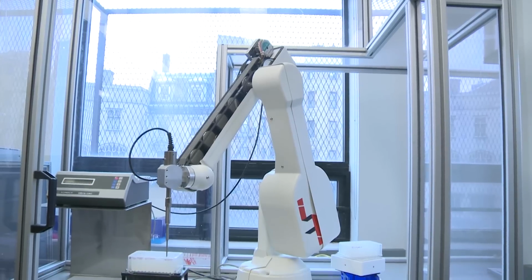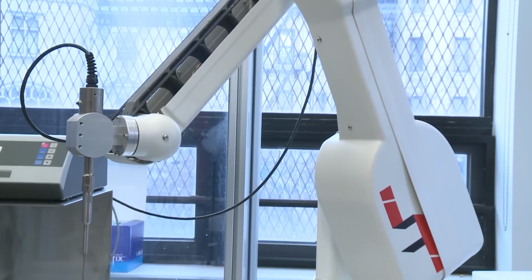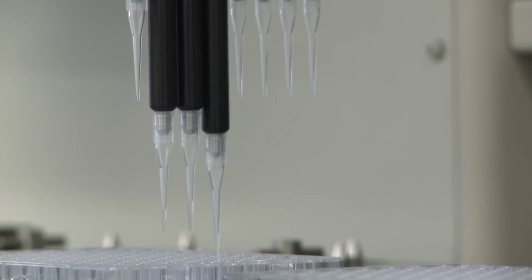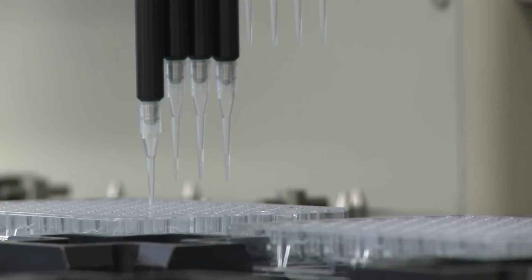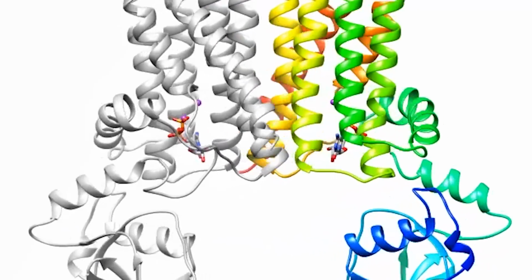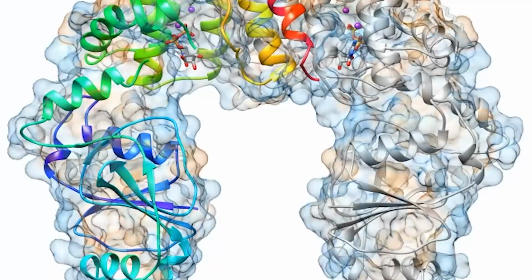The heart of our protein production facility lies in robotic devices that we have developed to be able to clone and express proteins in a high-throughput manner, many things simultaneously. These capabilities are being used to investigate in an efficient manner many kinds of proteins, but in particular by the New York Consortium on Membrane Protein Structure, NYCOMPS, we are investigating membrane proteins, and that's to the benefit of many of our investigators, including Filippo Mancia from Columbia University.